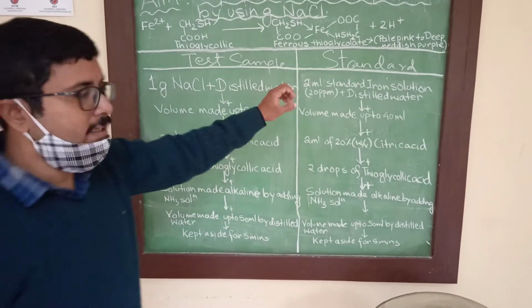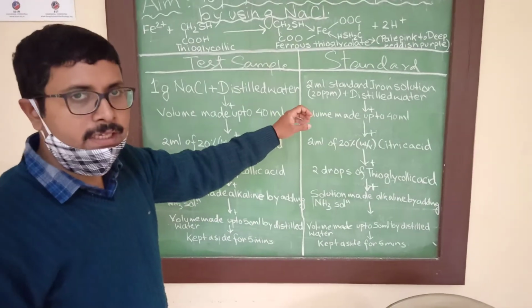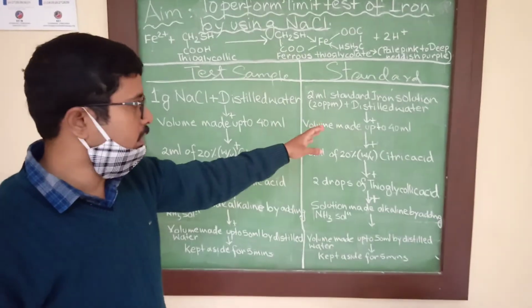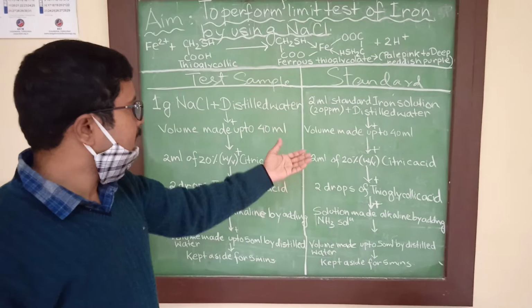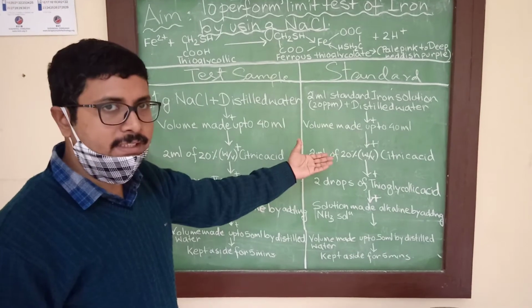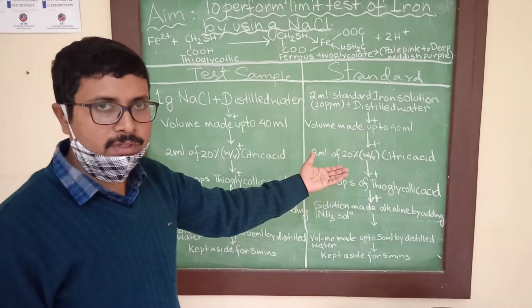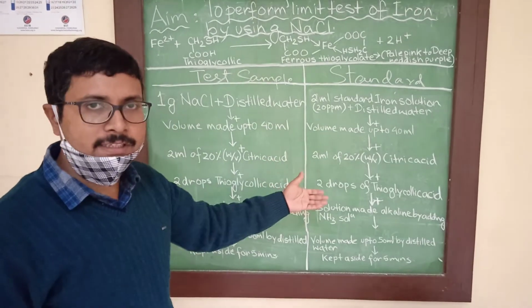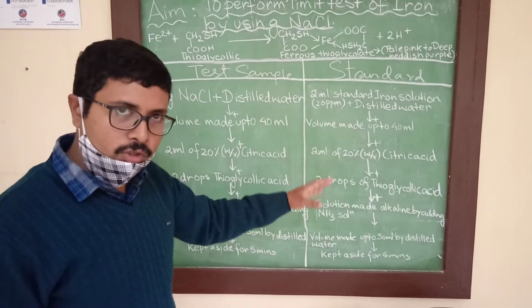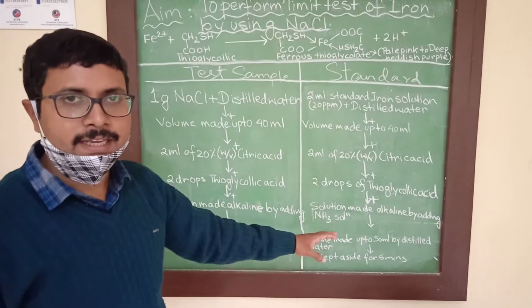Similarly, in case of standard solution, we use 2 ml of standard iron solution 20 ppm and dissolve the solution in distilled water and make up the volume to 40 ml. Then again, similar to the test sample, here also we add 2 ml of 20% weight by volume of citric acid, and then 2 drops of thioglycolic acid are added to this solution, and the solution is made alkaline using ammonia solution. Then the volume of the preparation is made up to 50 ml using distilled water, and the entire preparation is again kept aside for 5 minutes.